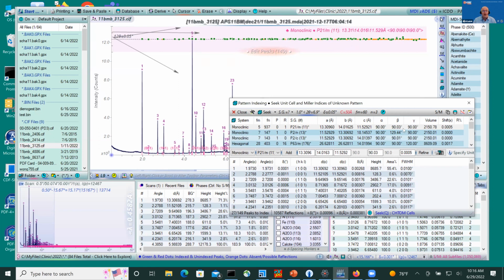You know, JADE was really right. I didn't really trust it that much at the beginning, but it turned out to be right. It just means there are 2 molecules to find instead of 1. But with really good data from a synchrotron, indexing can be really straightforward. So I got to start you with a good example.